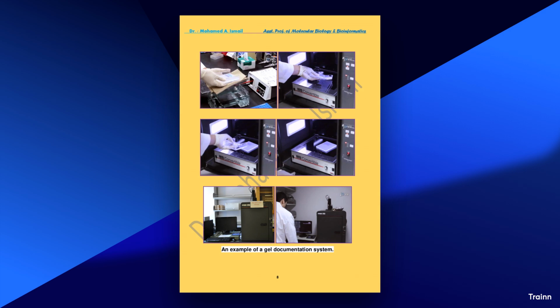Description: primer dimers occur when primers anneal to each other instead of the target DNA, forming short, unintended PCR products. Identification. Appearance: typically appear as small bands at the bottom of the gel, often below the expected size of the target product. Band intensity: may have higher intensity than the target band if the PCR conditions favor their formation. Causes: high primer concentration. Excessive amounts of primers can increase the likelihood of dimer formation. Low annealing temperature: a temperature that is too low can promote nonspecific binding.